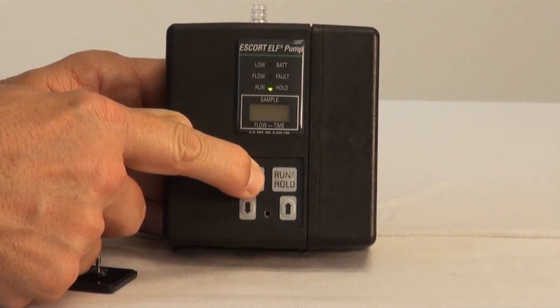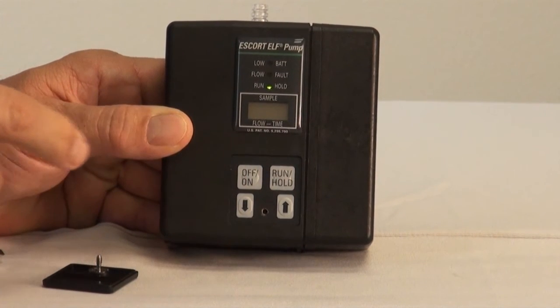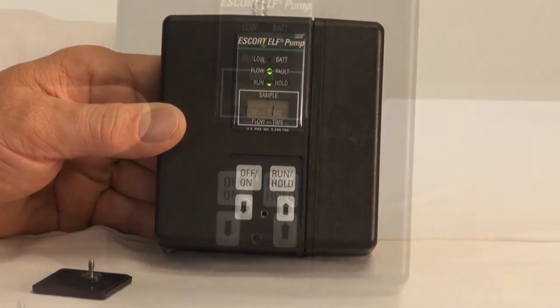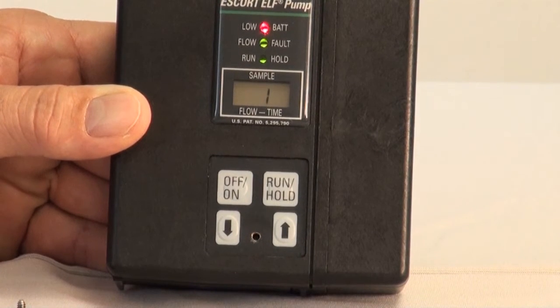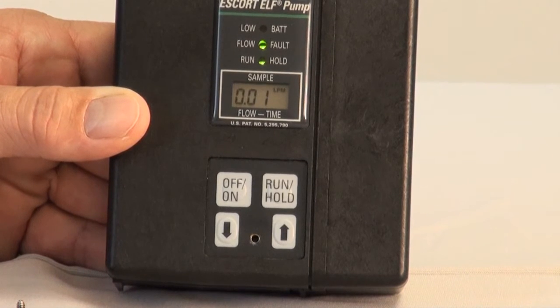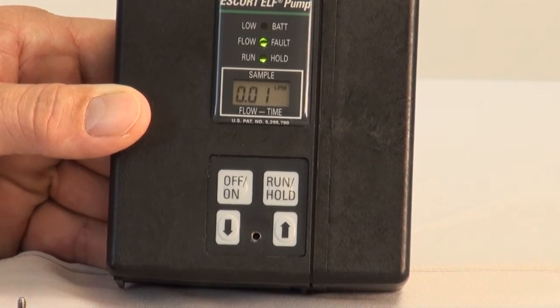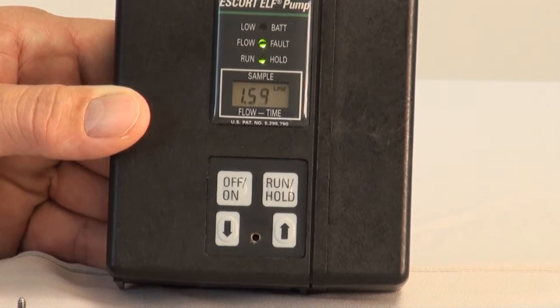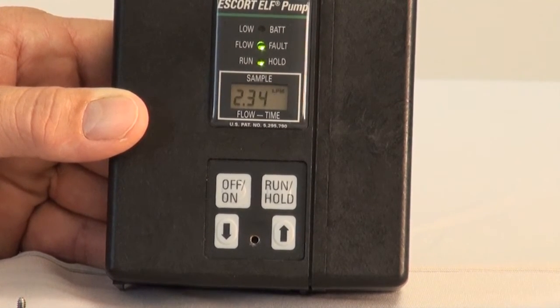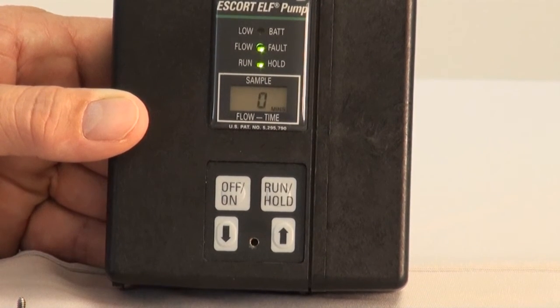The run-hold LED light will come on. In the LCD display, you will see the total number of operational hours since the last calibration. You will then see the LED lights of the flow fault indicator and the low battery indicator come on — this is to ensure the LED lights are functioning. The LCD screen will then flash three-eighths in the display to show all segments are functioning. You will then hear a slight hum as the pump sends a signal to the sensor and motor. There could be up to a five-second delay before the motor begins to run. At this point, only the run-hold LED light will be on, and the LCD display will begin alternating between the elapsed time and the flow rate. It is normal for the flow fault light to come on and off as the pump reaches a set flow rate.